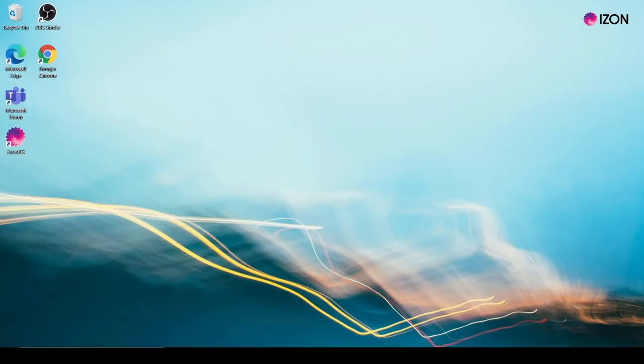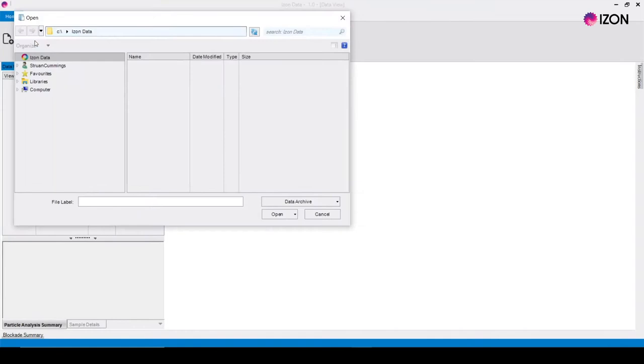Open the iZON data suite and click on the open data files button. Navigate to your documents directory for your exoid data and open the folder for the investigation you would like to process.